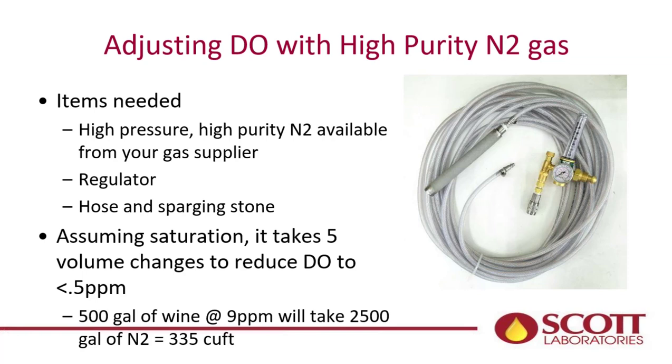So real quick, I'm gonna blow through this because I've belabored this before in the past, but using a stone setup like this and high purity nitrogen, you can remove almost all of the dissolved oxygen, which will make your SO2 adds much more effective. So if you're looking to use less SO2 for some sort of philosophical reason, this is a really good tool to have in your arsenal.